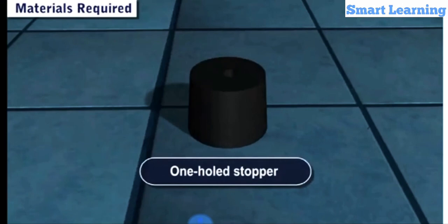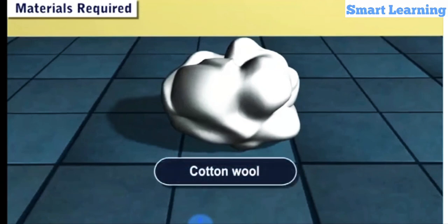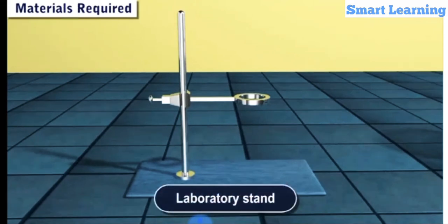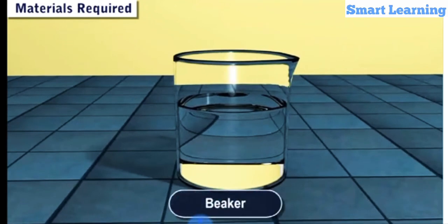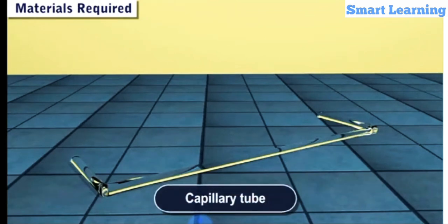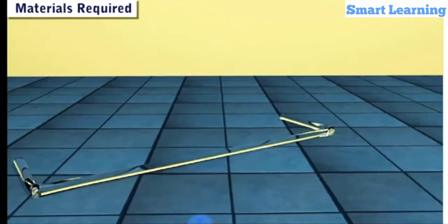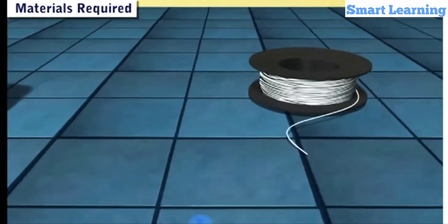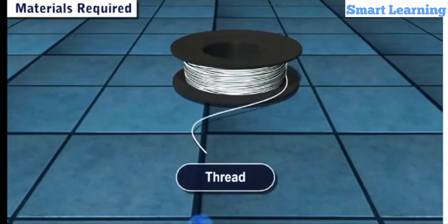One-hole stopper, cotton wool, laboratory stand, beaker, capillary tube, petroleum jelly, and thread.